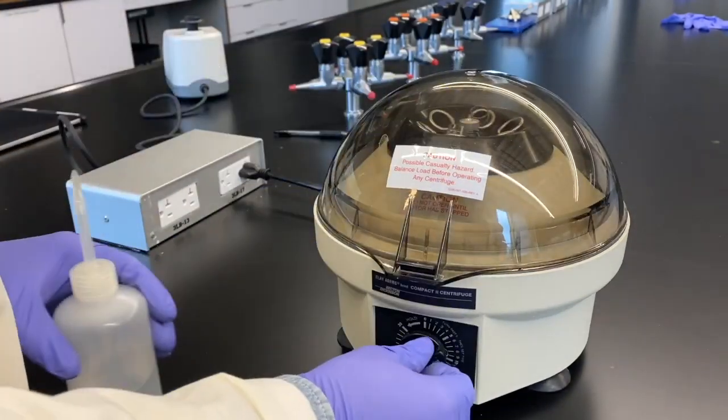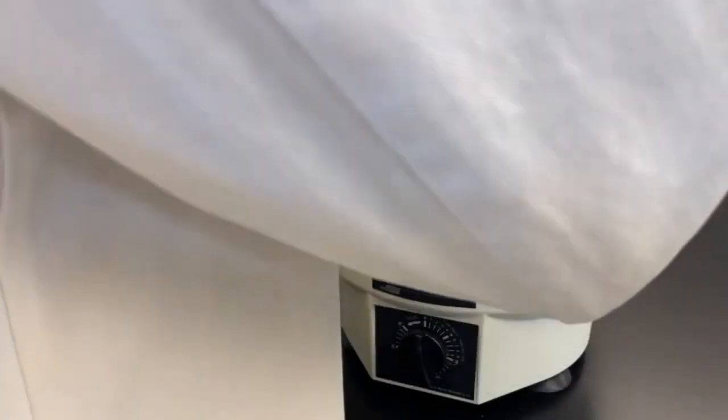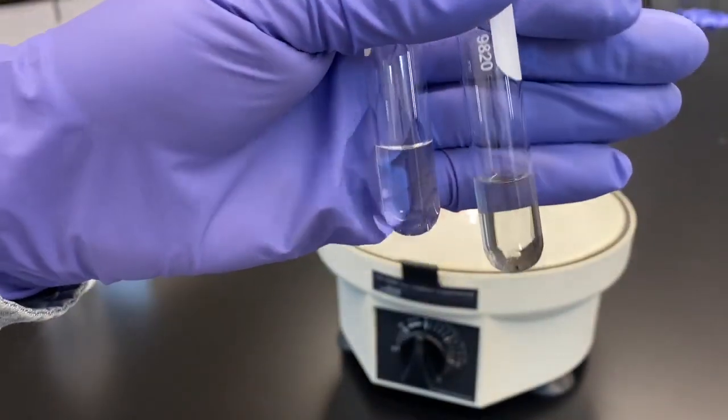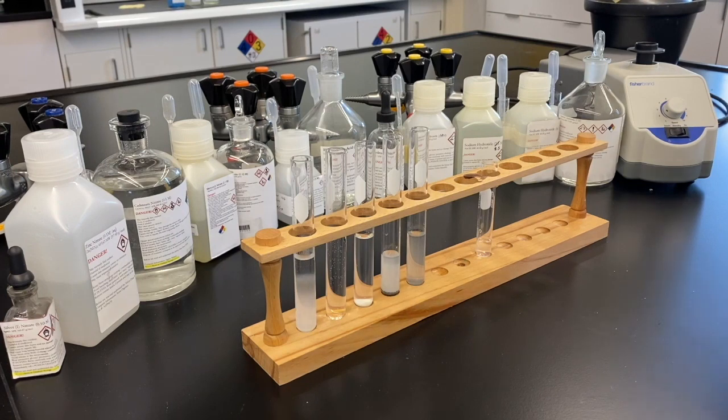So we could have both, just on that left side of the table, we could have both mercury 1 and silver. Right? Remember, the silver was aqueous with ammonia, whereas the mercury 1 was not. It made that black precipitate. So we have to separate this off too. Pour the supernate off, which could have silver, and test for silver, and then hang on to that pellet, which has the mercury 1 for sure.